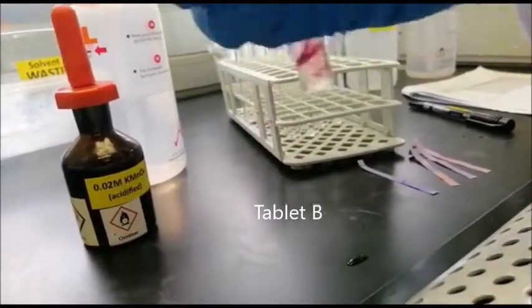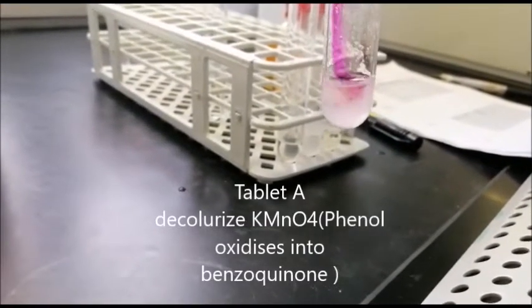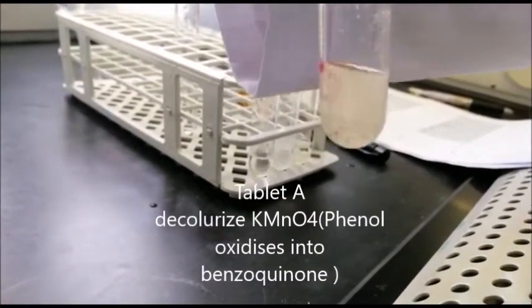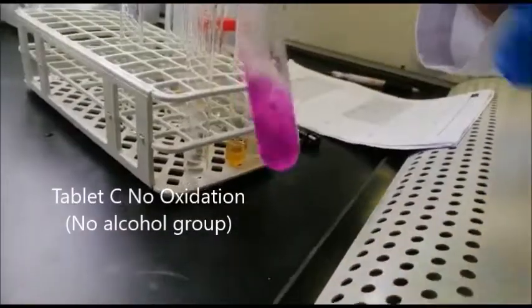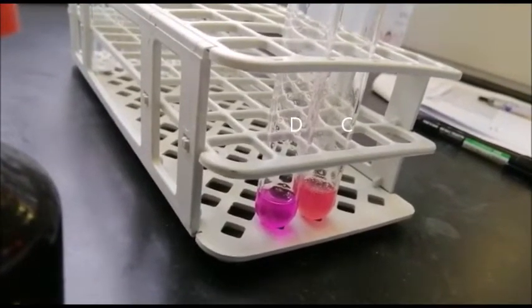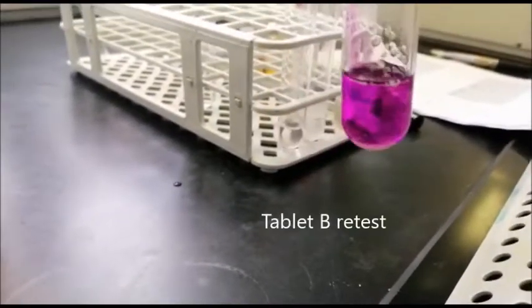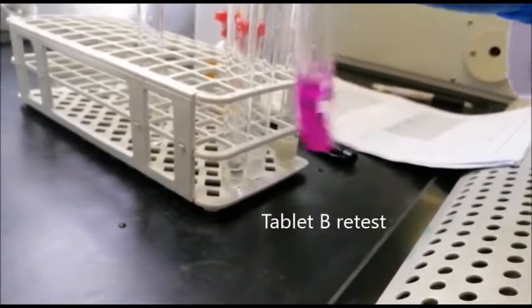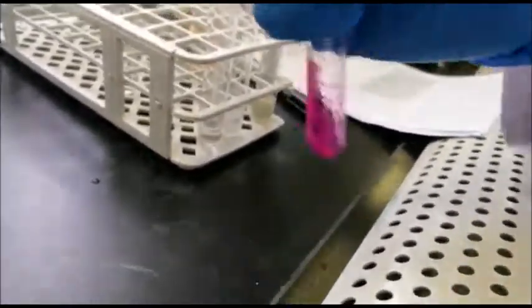The third test was an oxidization test using acidified KMnO4 to differentiate the last 2 drugs, ambroxol and loperamide. This is because ambroxol only has a secondary alcohol group, while loperamide only has a tertiary alcohol group. Thus, KMnO4 will only oxidize the alcohol group on ambroxol. The test mostly proceeded according to plan, barring 2 issues. First, drug C, already identified as aspirin, also produced a slight color change from pink to maroon. This was likely because initially drug C in water was cloudy, hence making the saturation of the purple-pink color lighter.